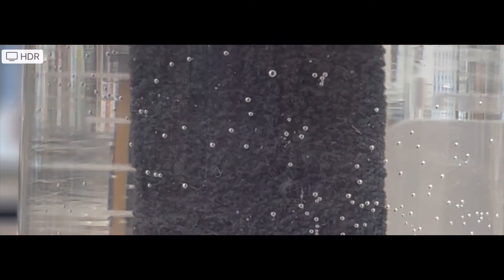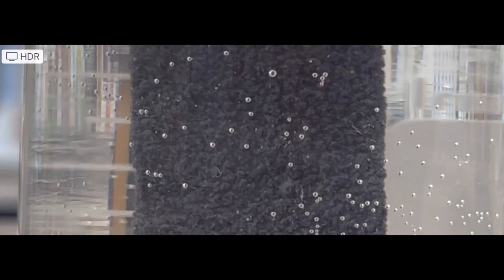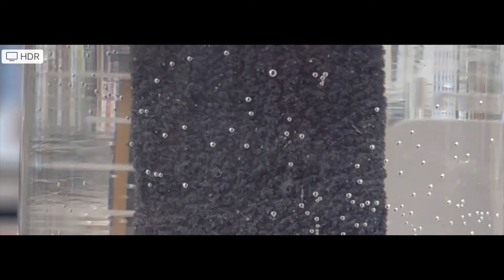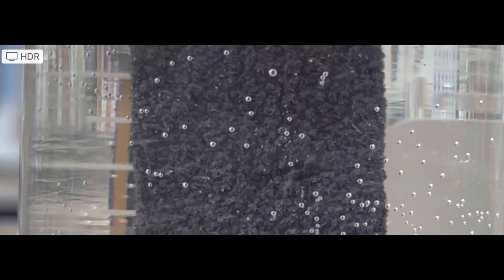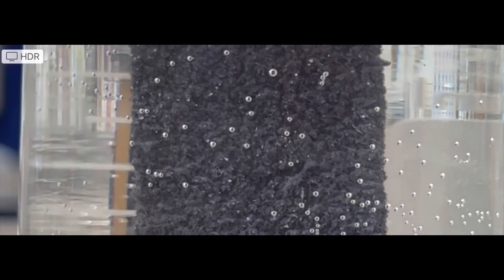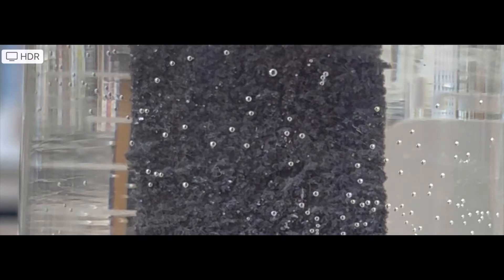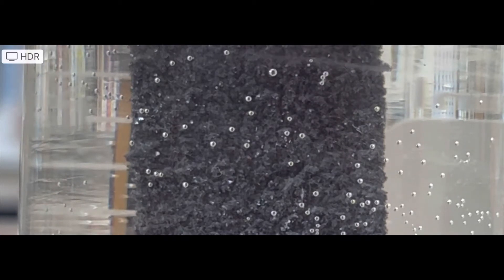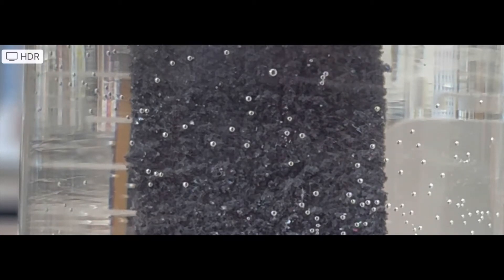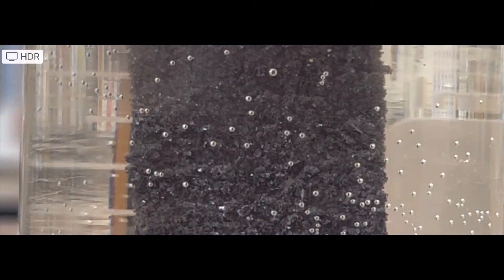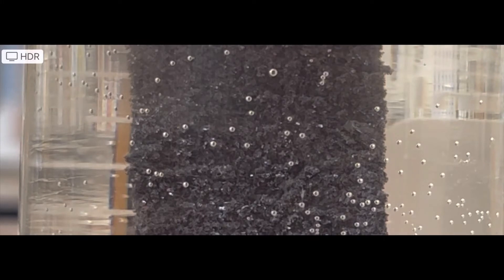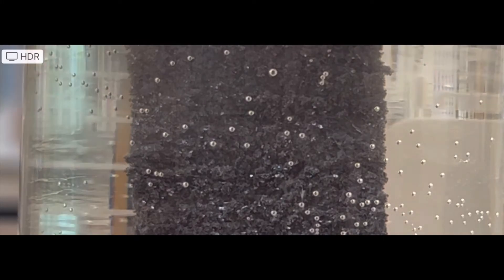So at this point, you can definitely see that zinc is replacing the lead and lead nitrate because zinc is higher on the activity scale than lead. Look at those crystals grow. And your lead nitrate is becoming zinc nitrate.